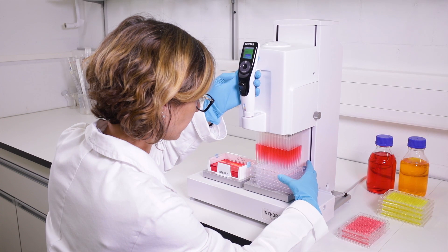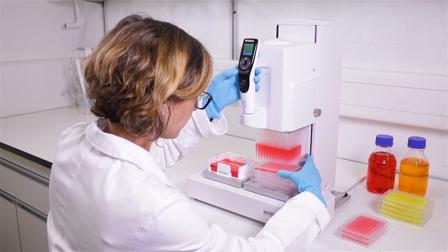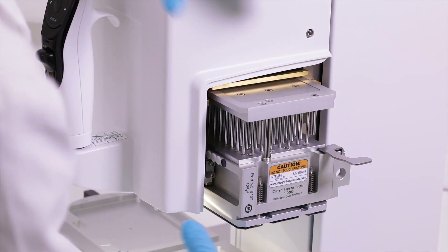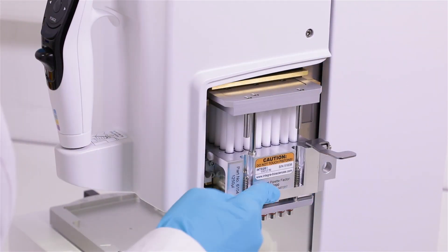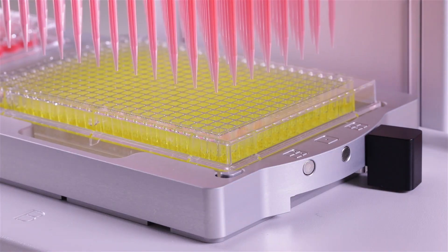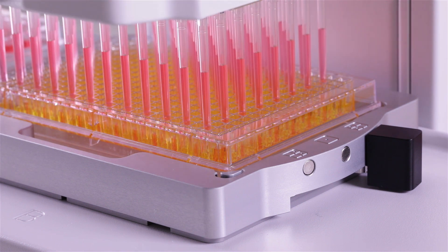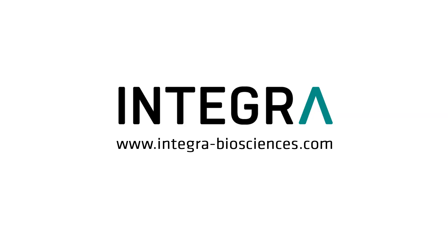The hand-guided VIAFLOW 96 and 384 are as intuitive and easy to use as any traditional handheld pipette. Thanks to the exchangeable pipetting heads, you're always working in the optimal volume range for best accuracy and precision. Pipetting 96 and 384 samples with the push of a button brings your pipetting productivity to a whole new level. For more information, visit our website.